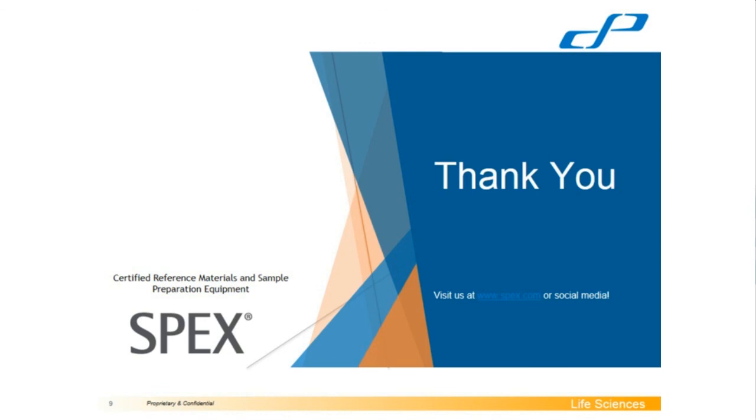I like to reverse my column when I do a cleaning, so I'll clean it the normal direction, and then I'll reverse it, and I'll clean it the other direction for a little while, and then I'll just put it back the way it was, and I'll run some normal runs through it. But it does a fairly decent job of cleaning it up.